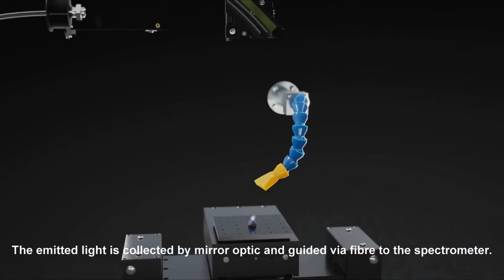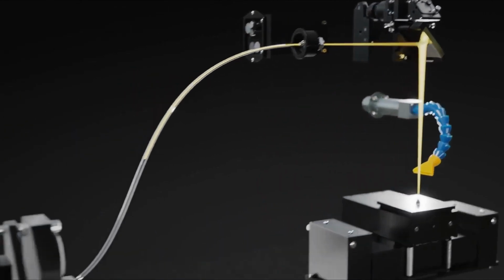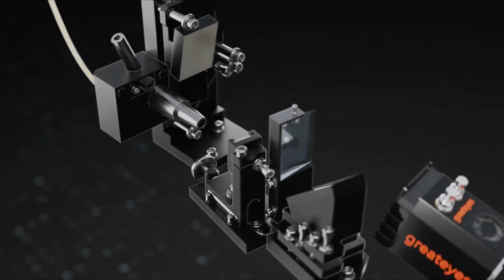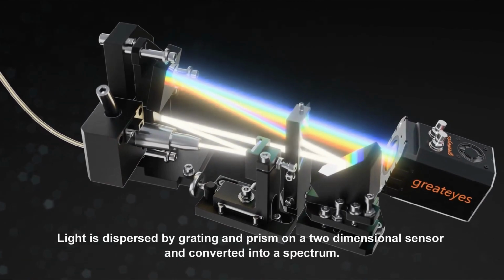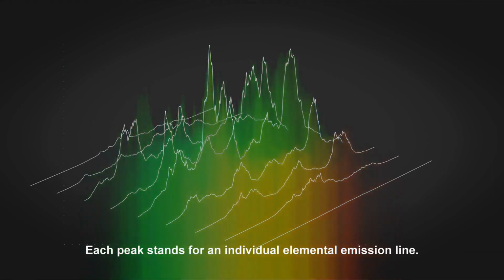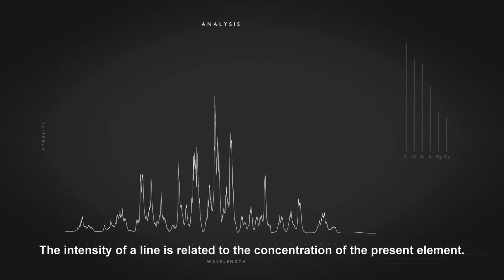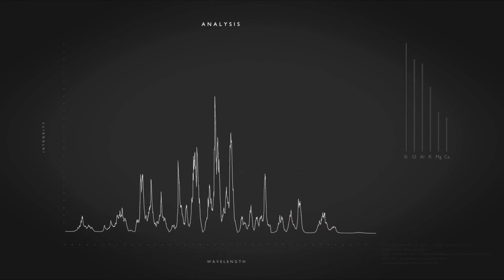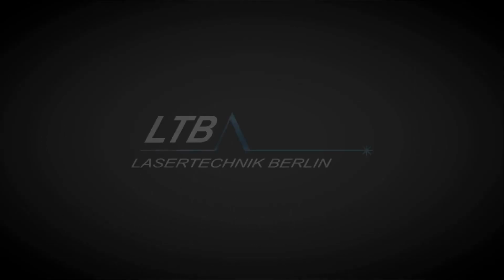The emitted light is collected by mirror optics and guided via fiber to the spectrometer. Light is dispersed by a grating and prism on a two-dimensional sensor and converted into a spectrum. A spectrum can consist of thousands of lines. Each peak stands for an individual elemental emission line. The intensity of a line is related to the concentration of the present element. This allows quantitative analysis with prior calibration using reference samples.